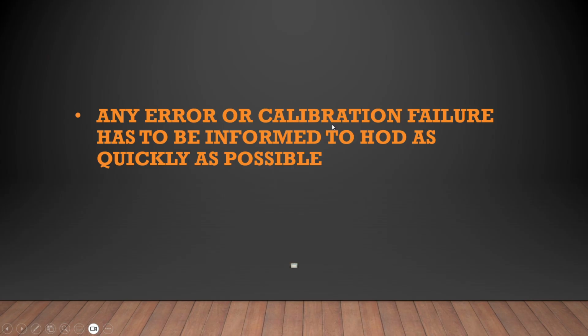Please do remember that any calibration failure at any time of the day, even in the night also, I have to be called and informed that the calibration has failed, and what next needs to be done. You need to discuss with me. Hope you understand. Thank you.